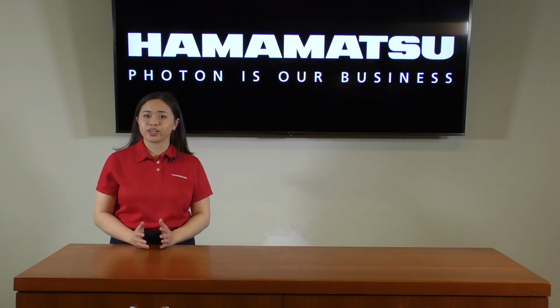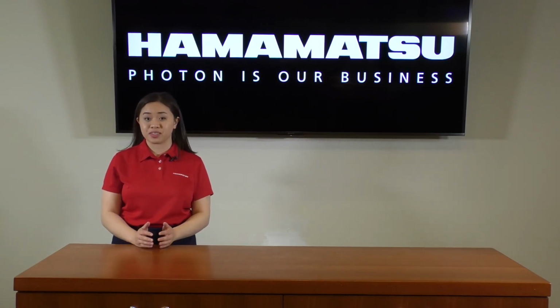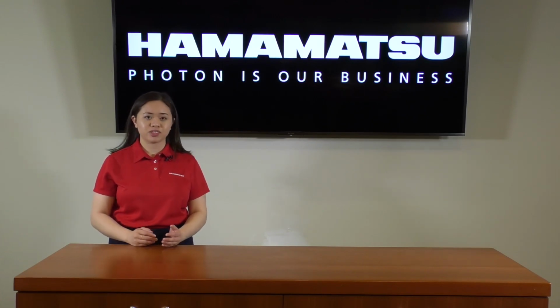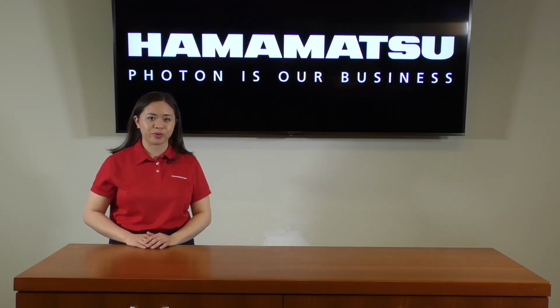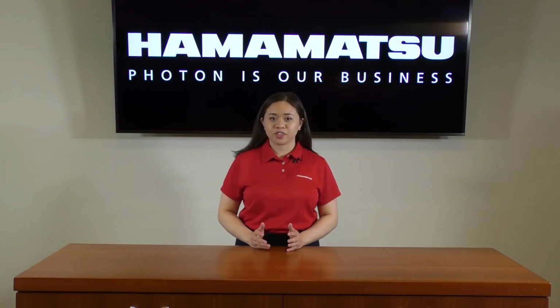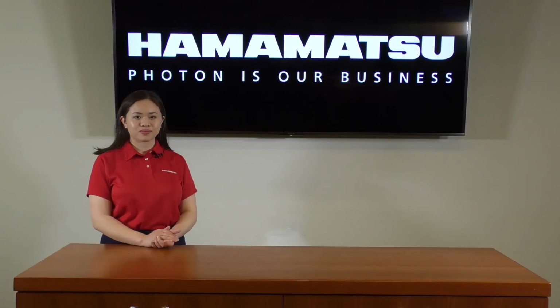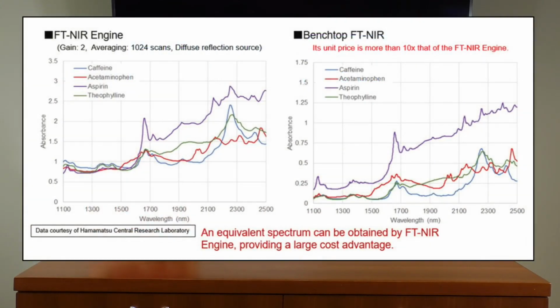This uncooled grating type spectrometer has sensitivity up to 1700 nanometers, covering points necessary to detect differences of theophylline concentration in a sample. The grating type spectrometer features fast response, so it should be the best option for inline measurements. Shown here are other samples measurable with these spectrometers.